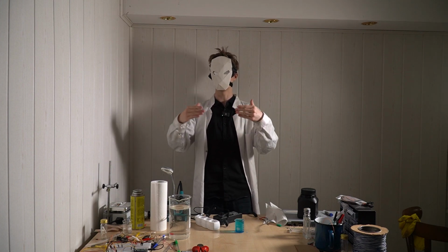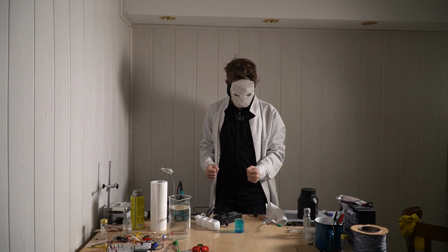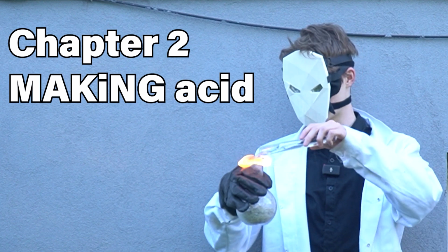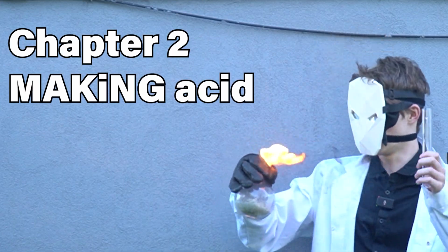And for that, we basically need a different electrode. Damn, I always forget which one is the cathode and which one is the anode. You know what, this has gone on for too long already, and I got some water, so let's put it out. Oh, no. Alright, so let's start with the protagonist, copper sulfate.